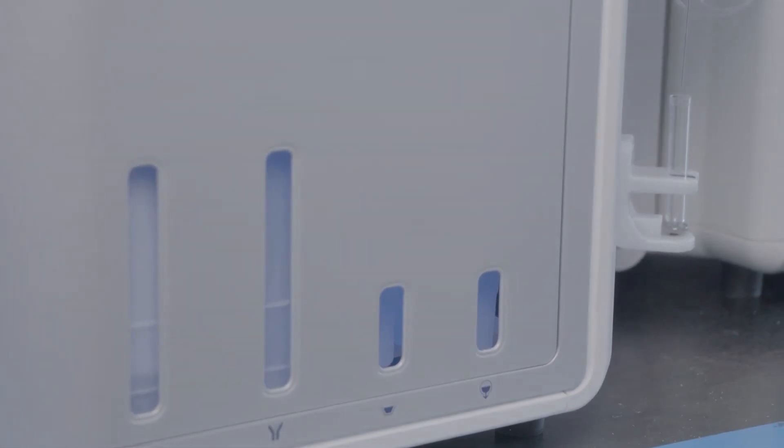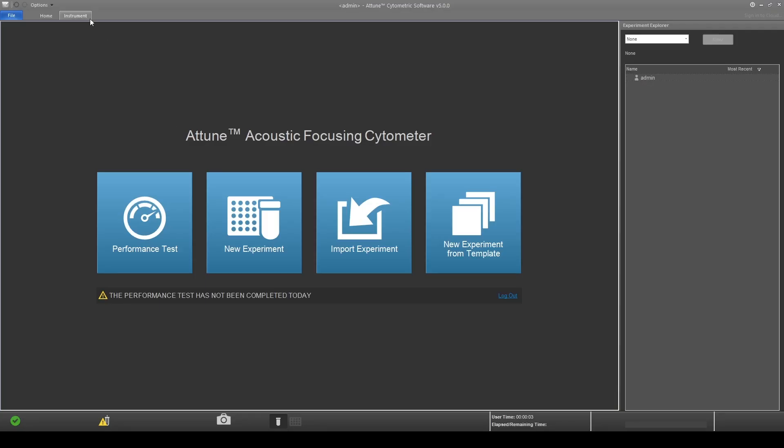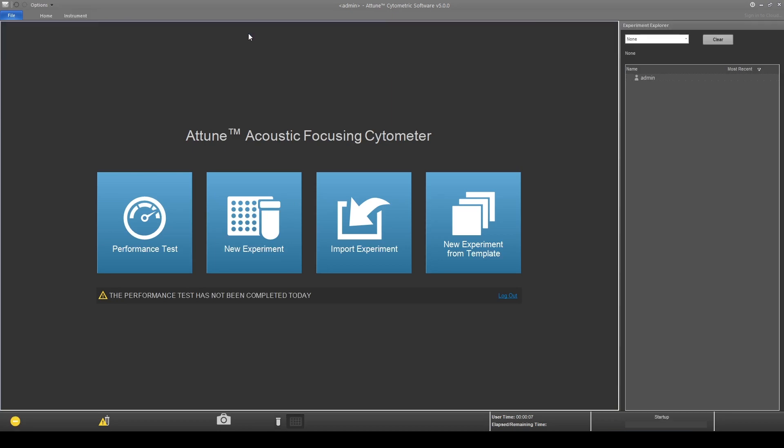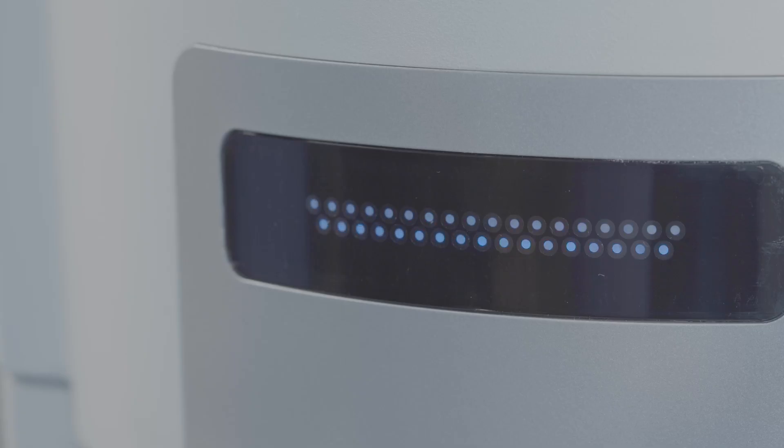Now we can start the Attune SitePix flow cytometer. On the instrument tab, click on the startup button. You can visually observe the startup progress. The blue flashing light on the Attune SitePix flow cytometer indicates the startup procedure is in process. The lights will turn solid green when startup is complete.